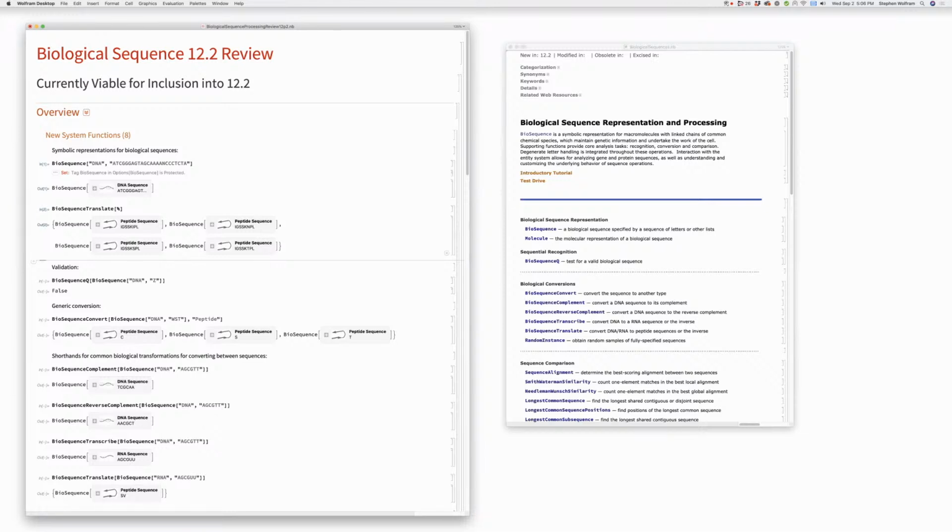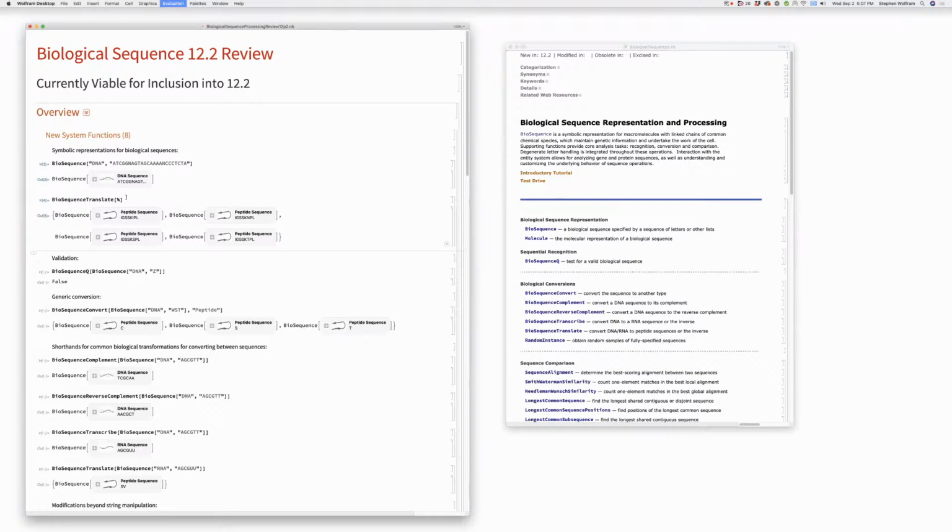Okay, now what just happened there? So now it's given all of the translations to the peptide sequences available from the sequence above. Oh, I see. By default, it expanded the N into all the possibilities. That's right. That's what we said last week should happen. Okay, so if I put another N there, why do I only get 4?